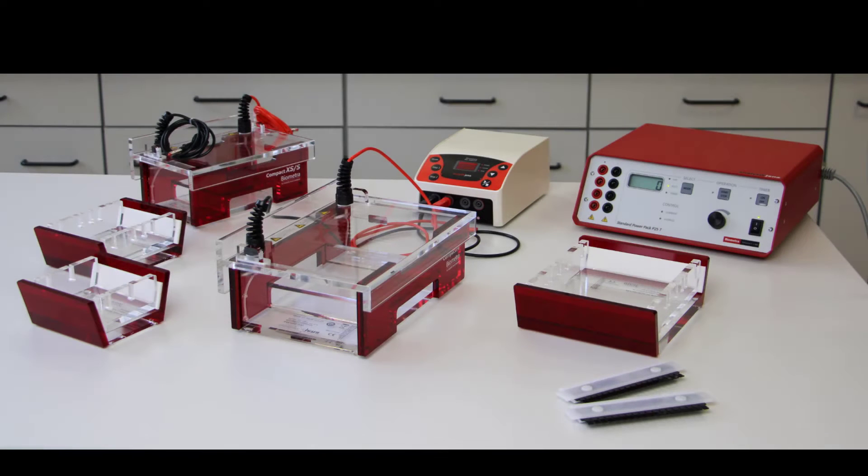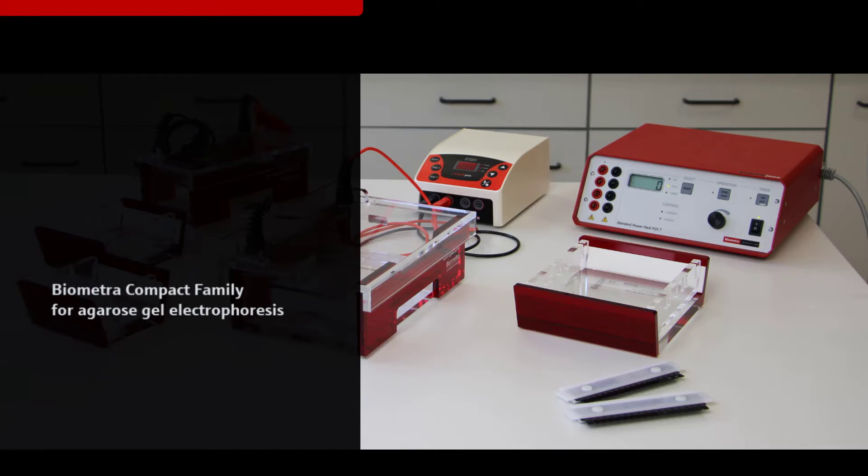The Biometra Compact family for Agarose gel electrophoresis combines features that are important for everyday laboratory work: robust, functional, and convenient to use.